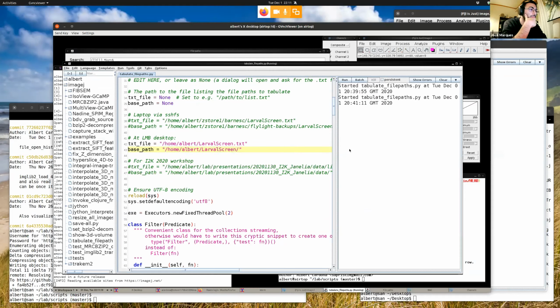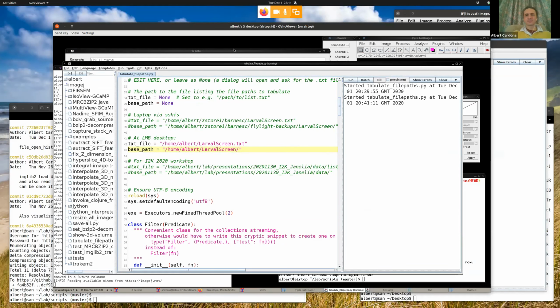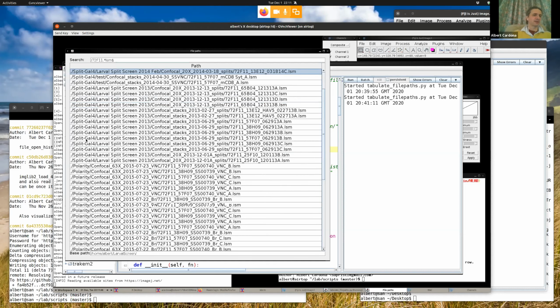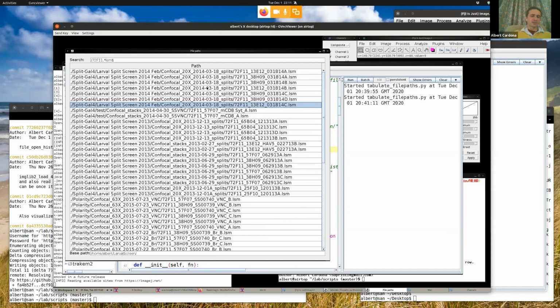Right, so going back to your question, what you're saying is, can I see how many files were matched? I didn't bother to add anything, but basically what you could add here is a label somewhere at the bottom that tells you matched 120 files or matched only 6 files or whatever. It would be easy to do. You could also add another column, which would be the index of the files as you see them here. Then the first one will be 1, and at the bottom, you'll know how many you have as well. This table is simple. It only has one single column with a file path, right?